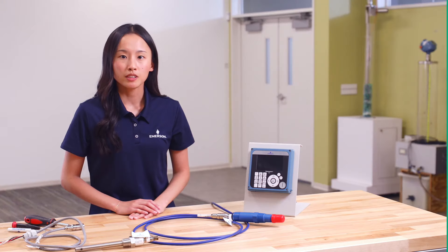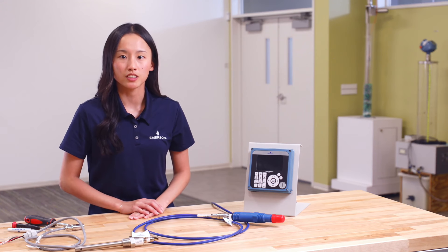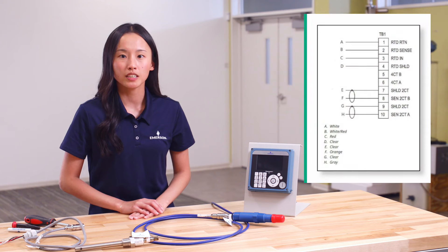Now, I will demonstrate how to connect the Rosemount 400BP contacting conductivity sensor, which has a different sensor card, to the 1058 transmitter. Use the corresponding diagram in the wiring section of the sensor's quick start guide.